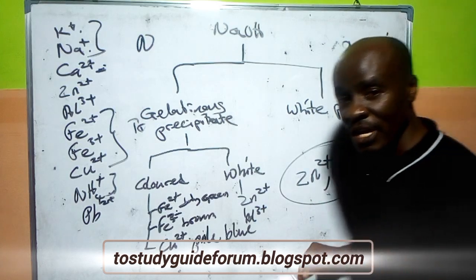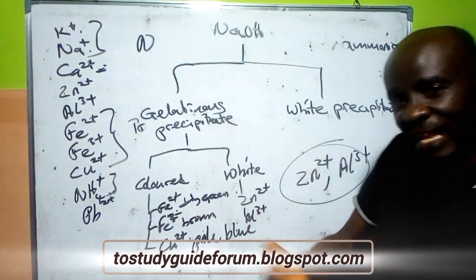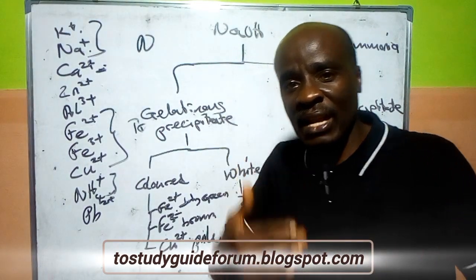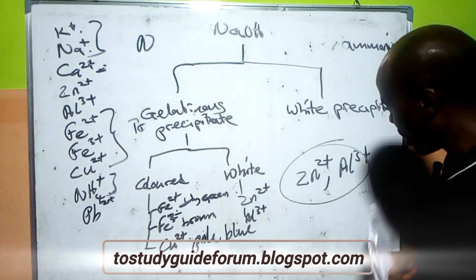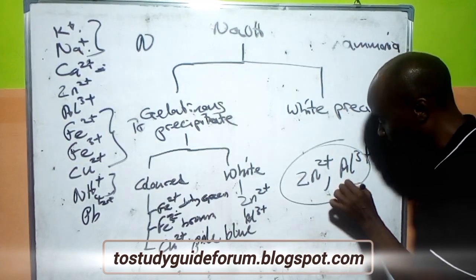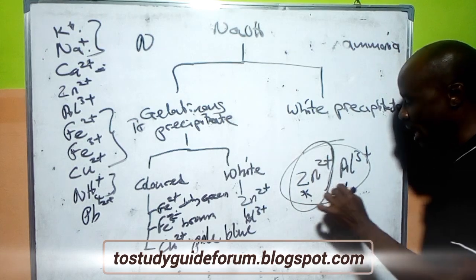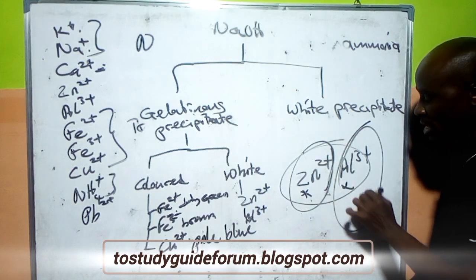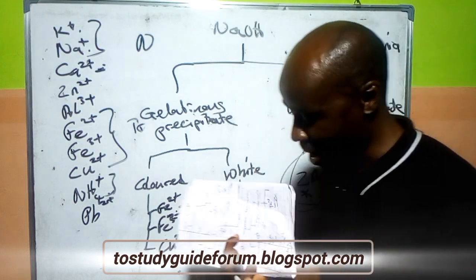But then let me just give you a hint. One of the ways of separating them, another test that's likely to come up there, will be what? Testing it with aqueous ammonia. In aqueous ammonia, this one is insoluble, while this one is soluble. That differentiates it. Well, another thing will happen there with the insolubility of this in aqueous ammonia, that we will talk about later.